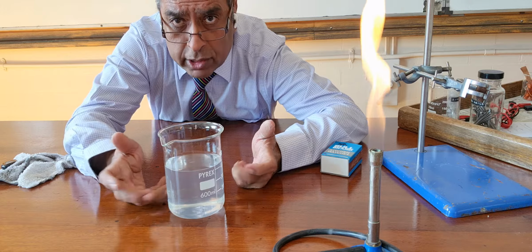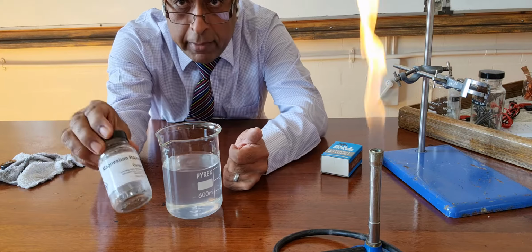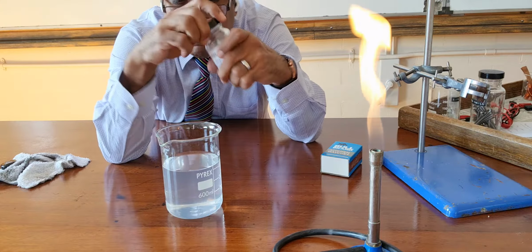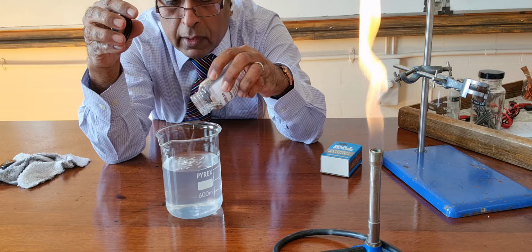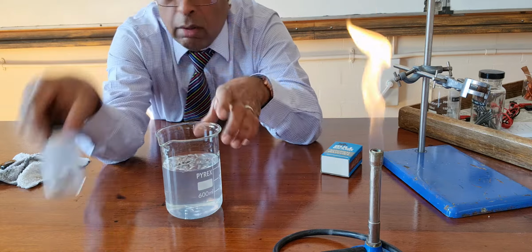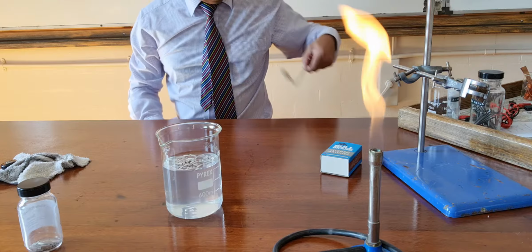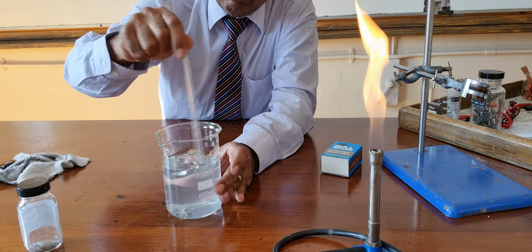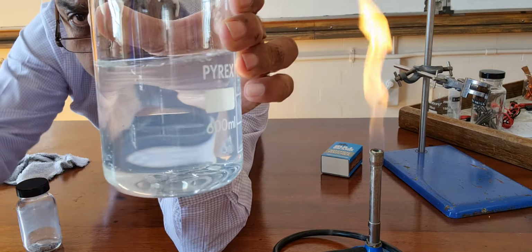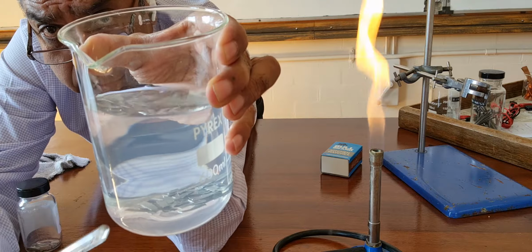Here I've got water, tap water, and here I've got some magnesium ribbon. Hope you can see that magnesium ribbon. Pieces of magnesium, and if I put those in there, and look, let me show you. There's quite a lot of magnesium there at the bottom.